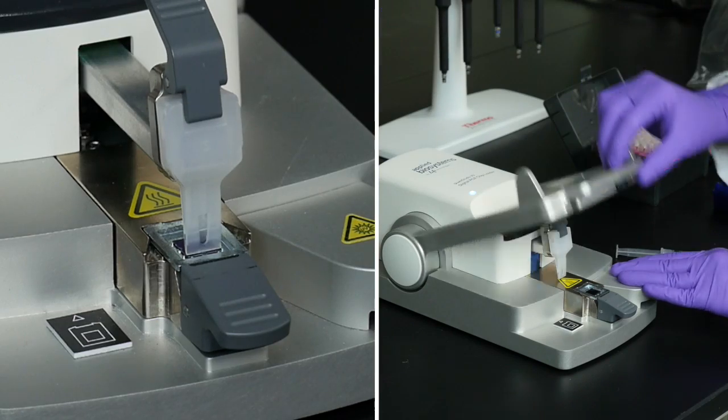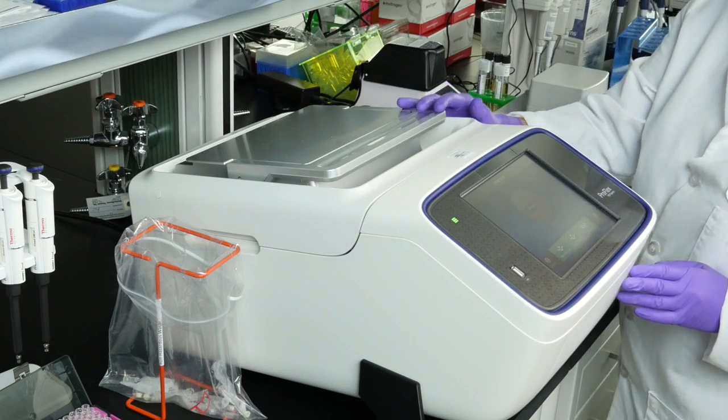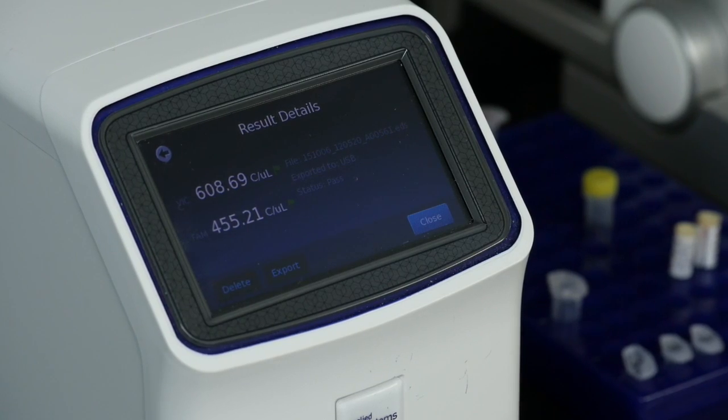Load and seal the sample, amplify using PCR, and read and analyze your results. Let's take a closer look.